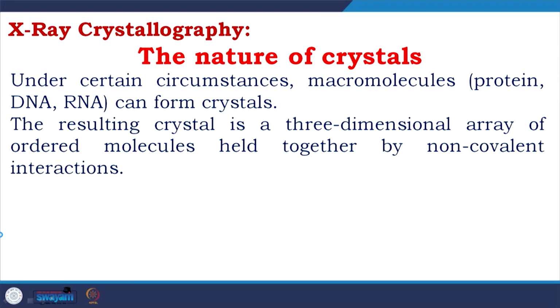So, what is the nature of the crystals? Under certain circumstances, biological macromolecules like protein, DNA, RNA can form crystals. It is not every condition or a common condition. We will discuss this. Forming a crystal is the main factor to get the technology forward, because in most cases, as statistics says, only in 8% of cases, when you are doing everything correctly, do you find yourself lucky enough to get a crystal.